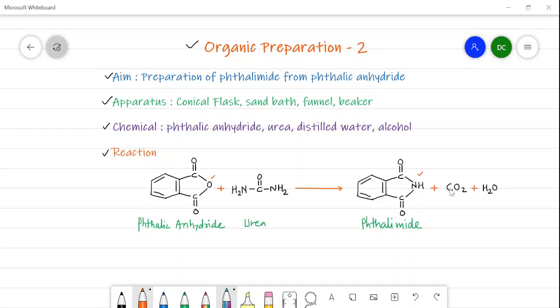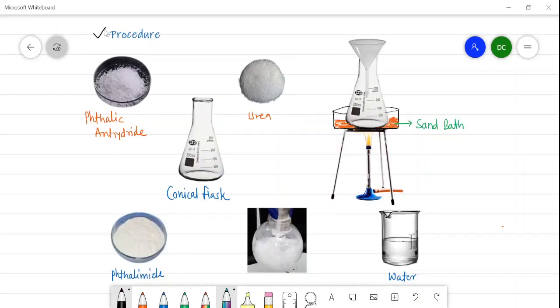Now we will see the procedure of this preparation. In the procedure we have to take phthalic anhydride and urea into the conical flask. So phthalic anhydride about 10 gram and 2 gram urea is taken into the conical flask. They are mixed together and heated on a sand bath for 15 minutes, and a funnel is kept like this on a conical flask, then heating is started.